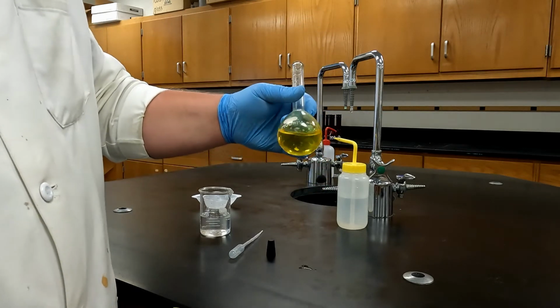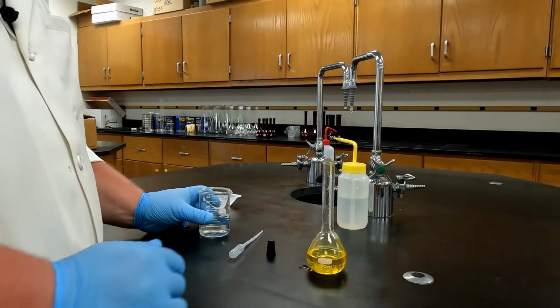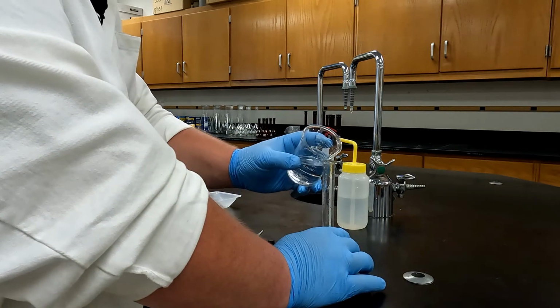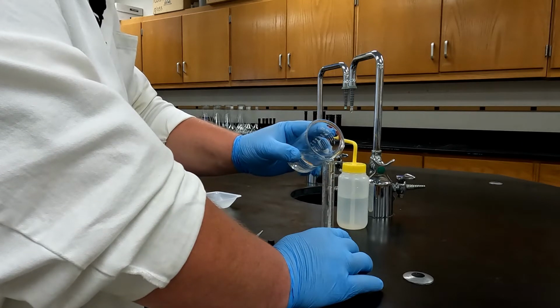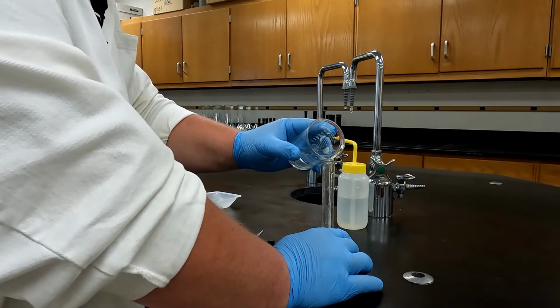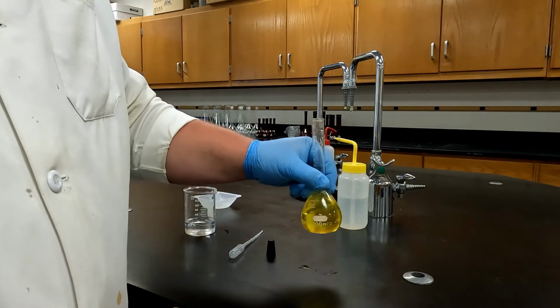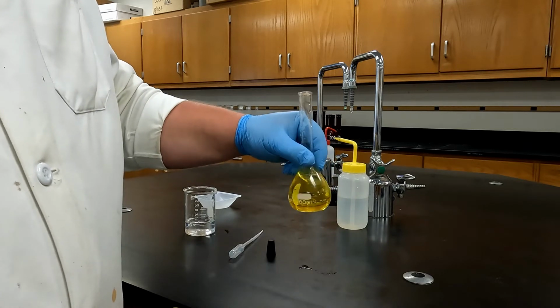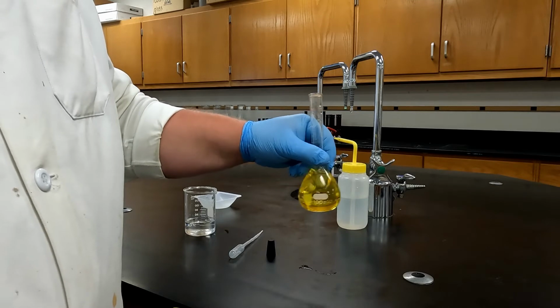As I'm swirling, I'm inspecting, seeing if all of the solid has dissolved. If not, I can add a little bit more water and swirl again. Got just a little bit of solid that's being stubborn in here. So I've added a little more water and I want to swirl it again. My goal is to have all of the solid dissolved before I finish filling this up.